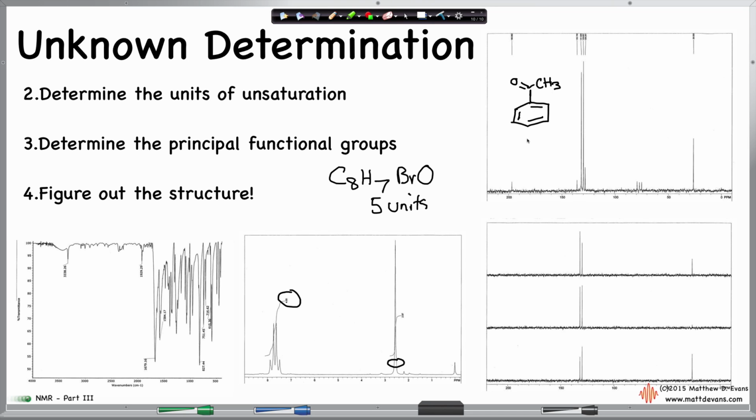Now, what about the bromine? The hardest part, and we've almost got the structure already, is to know whether it's ortho, meta, or para. You don't have this, but from intuition, this pattern looks a lot like para substitution. So I'm going to say that's a bromine. Let's see if that's consistent with the carbon signals. I would see 4 different types of carbon, so that's definitely consistent, versus the meta substituted. Let's draw this for a second and see what happens.